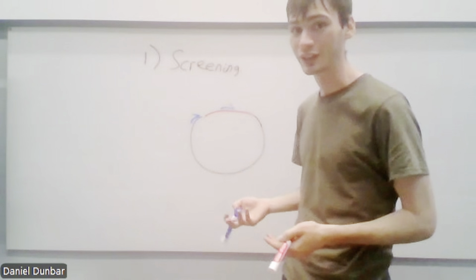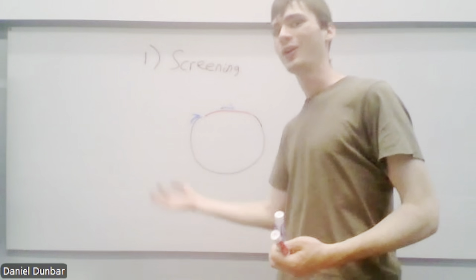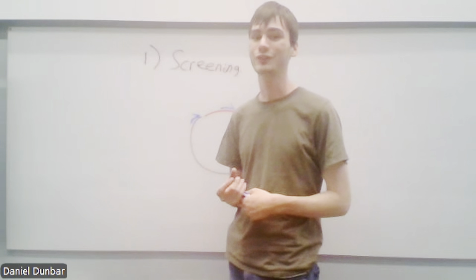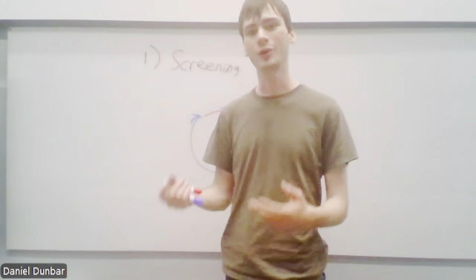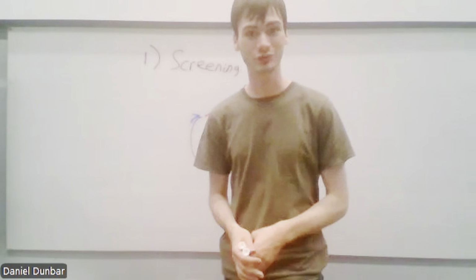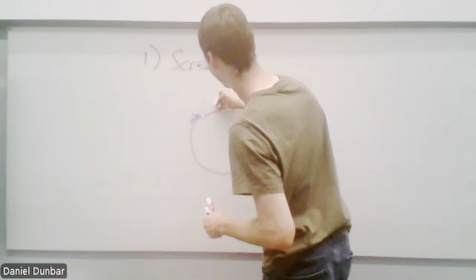So you can run it on a gel, and if you see nothing, then you know either there's nothing in there or its orientation is wrong. And if you combine that with another screening set of primers, then you can say, oh, okay, either the insert's not there or the insert's in the wrong orientation or the insert's in the right orientation, which would be good. I sincerely hope that happens for you.